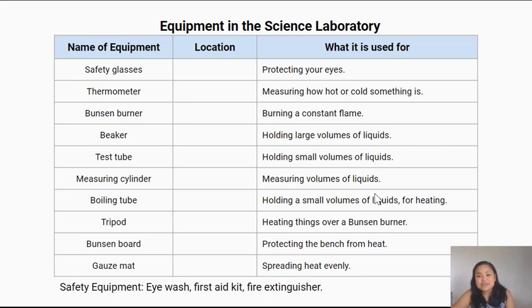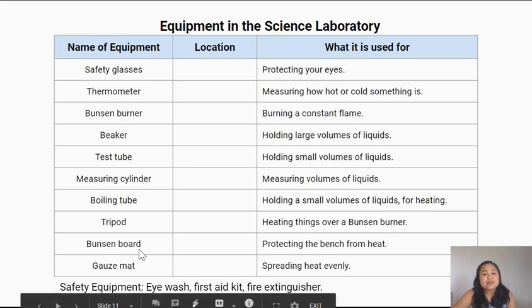The boiling tube is similar to a test tube, but with a test tube you can't use it for heating liquids — it's a boiling tube that you use. Tripods are used for heating things over a Bunsen burner. A Bunsen board is what we use to protect the bench from heat. And a gauze mat is used for spreading heat evenly.